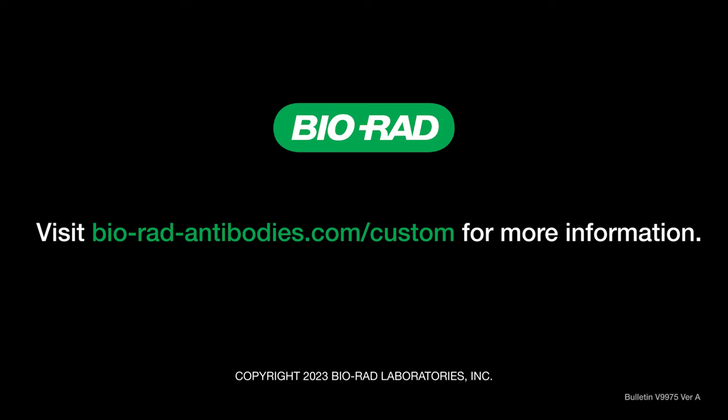It depends on the antigen. The more competition there is essentially for an antigen, the higher the affinity clones we will likely get out of that project. So if your target is very specific, for example, you have a single post-translational modification you're trying to generate antibodies against, I think it's less likely that there'll be as many antibodies in our library which would bind to this. So therefore, there'll be less competition essentially.